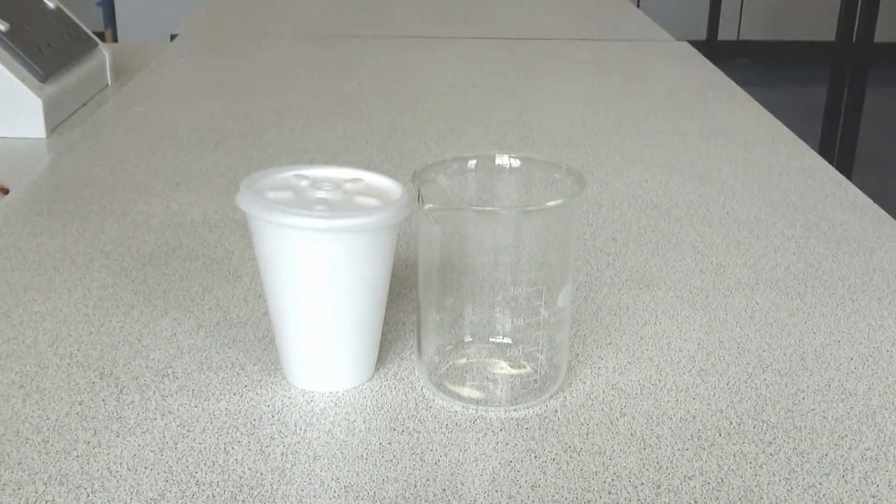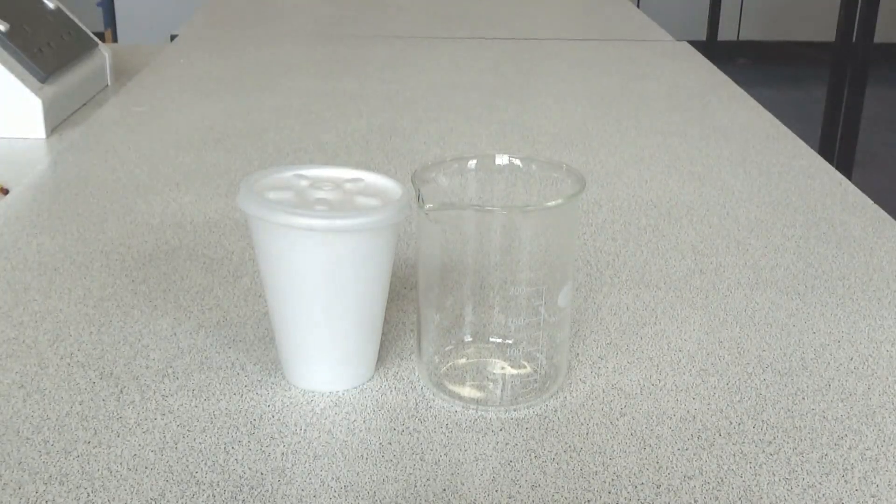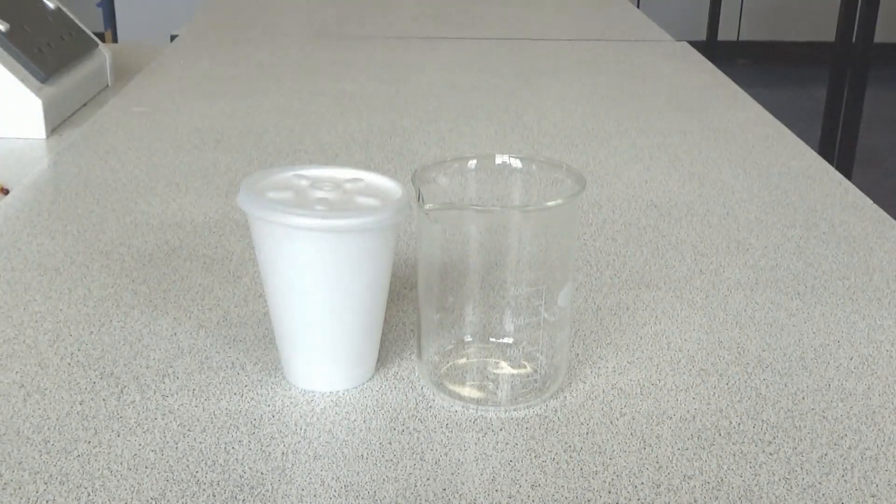We're going to carry out the reaction in a polystyrene cup with a lid so that it traps any heat given off by the reaction and we can monitor the temperature change. That lid could be something as simple as a piece of cardboard. In an exam question where the reaction is carried out in a beaker, the improvement would be to either insulate the beaker with cotton wool or carry out the reaction in a polystyrene cup with a lid.